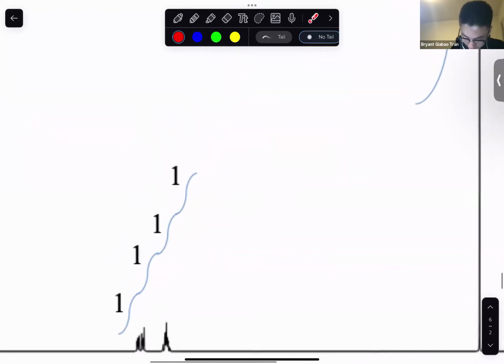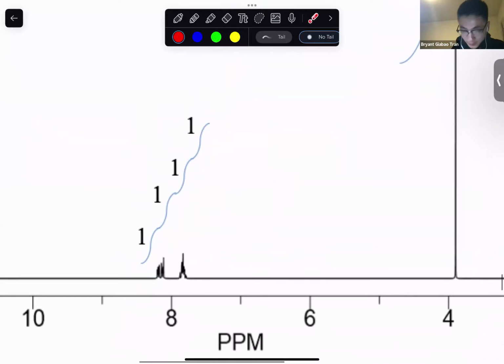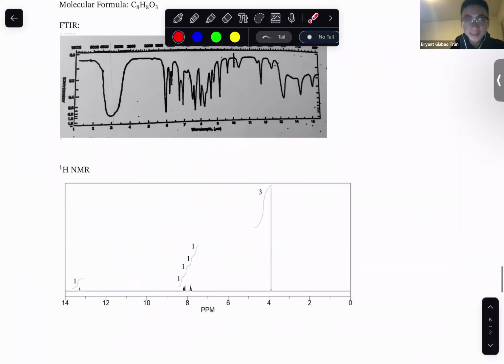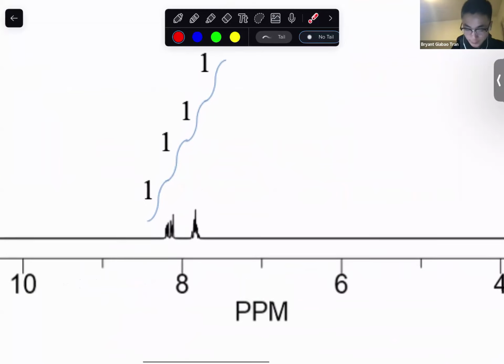This is not really well given, because on the exam you'll get more clear peaks. This was used for different professors like Levens, Nisiri, Mascal also has to use this because this is a lab thing which is whole separate from lecture. But yeah, I wouldn't have gotten meta from this either because it's too hard to read.